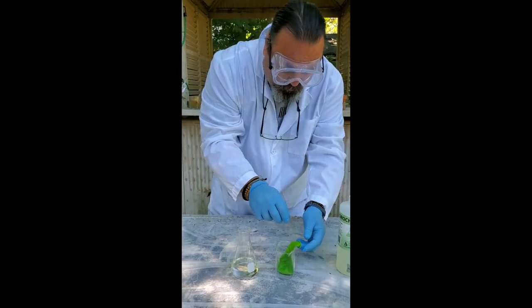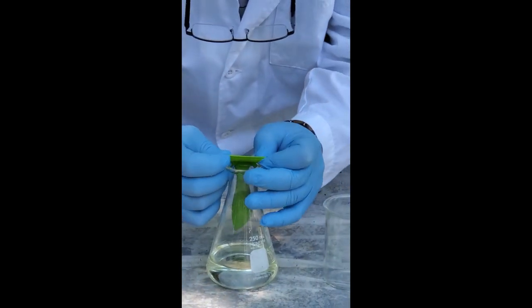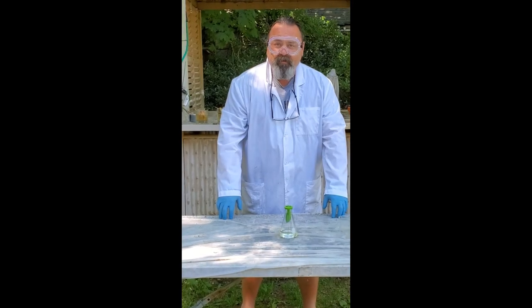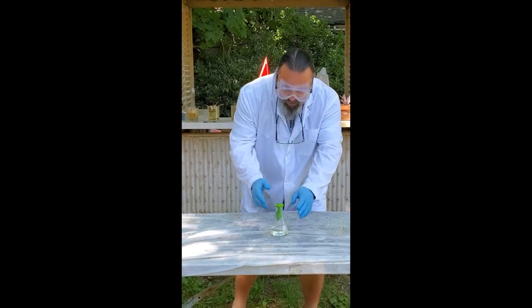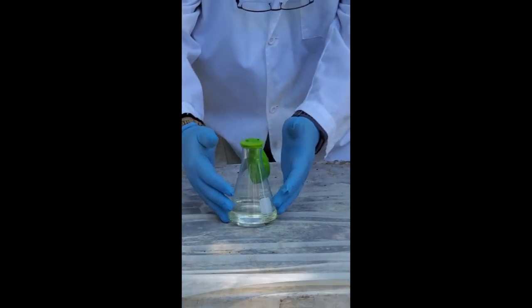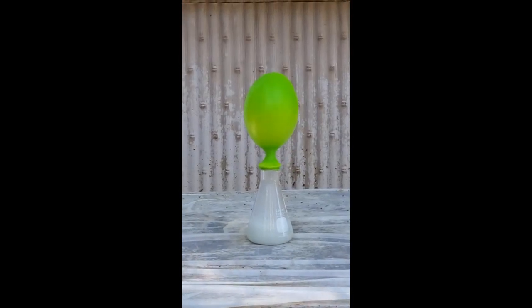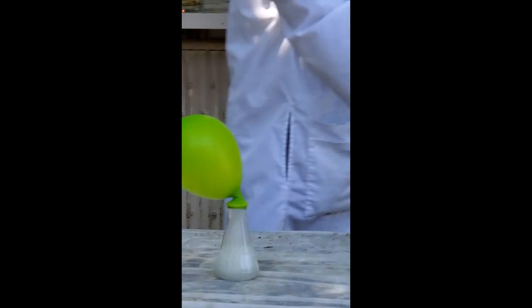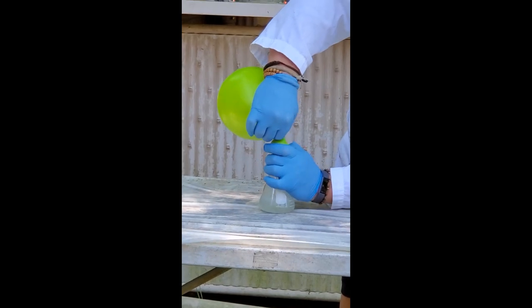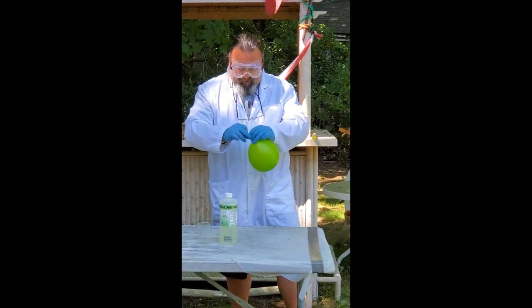Now the trick — and this is all live, kids — the trick is to not break the balloon while we're putting it over this lid. We've got zinc in the balloon and hydrochloric acid in the Erlenmeyer flask. Let's see what happens when we drop it. Something's certainly happening. That's a good amount. Now I'm going to hopefully see if I could save this by tying the knot.